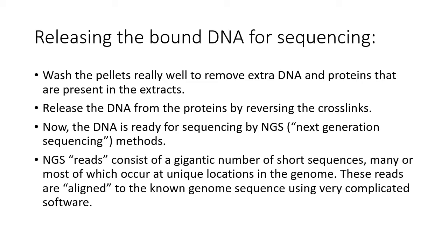These reads, or sequences, are aligned to the known genome sequence using very complicated software. Even a very short read can be uniquely aligned to a specific location in the genome. And that's what the software is going to do for us, and then display it in a user-friendly way.